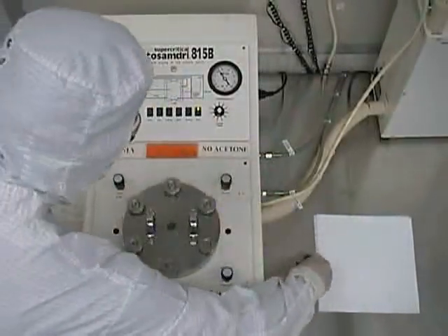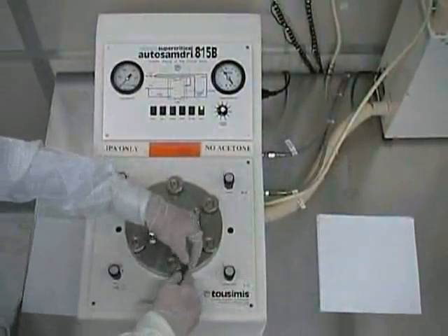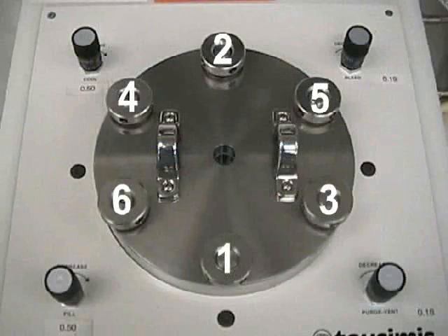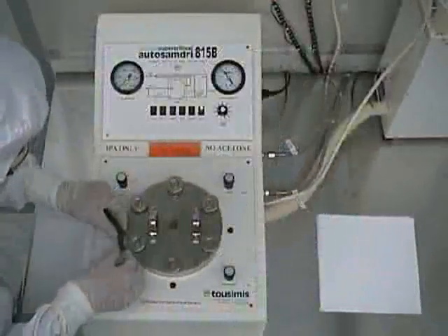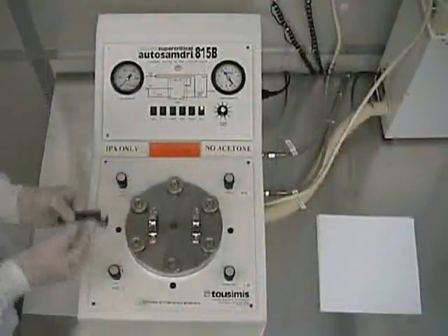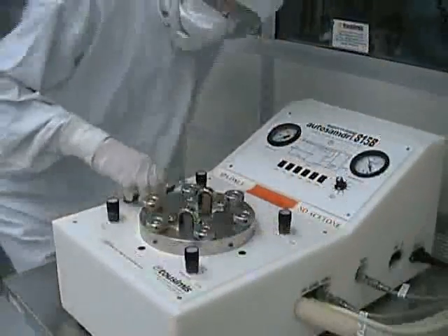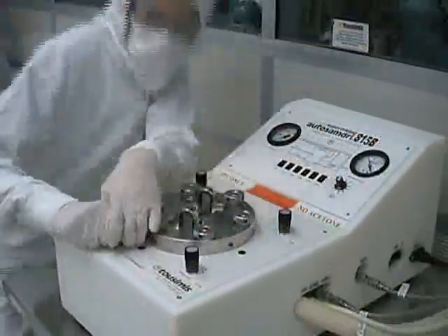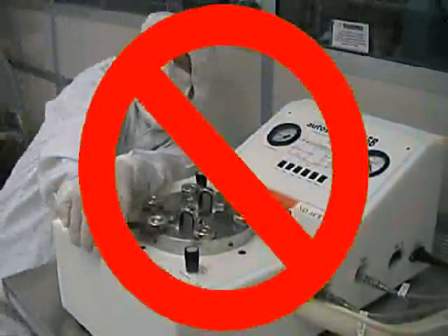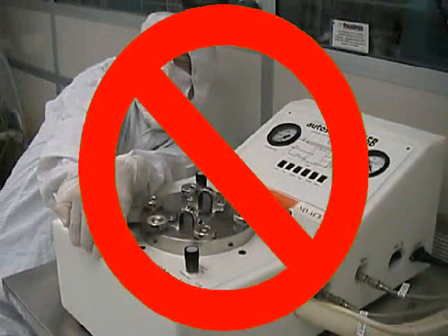Once they are as tight as they can get by hand, use the spanning wrench provided to tighten them the rest of the way. Each nut should be uniformly tightened in a star pattern following the numbered sequence shown. You should repeat this sequence until the nuts cannot be tightened any further. Never over-tighten the knurled nuts, as this could damage their threads and keep the chamber lid from sealing properly.